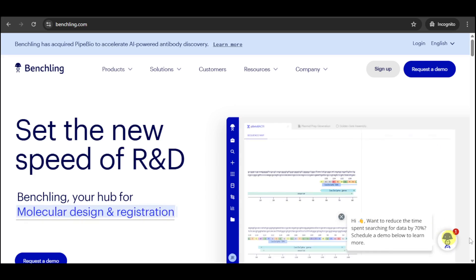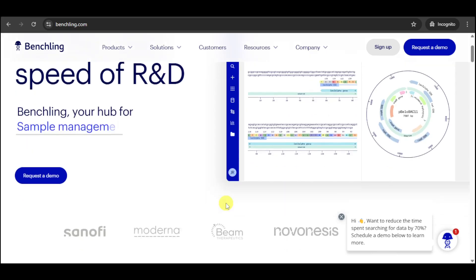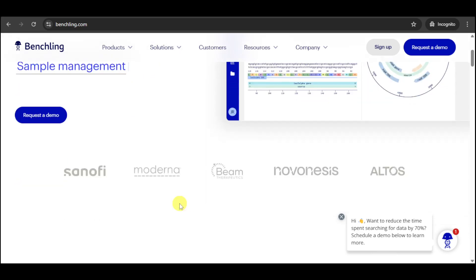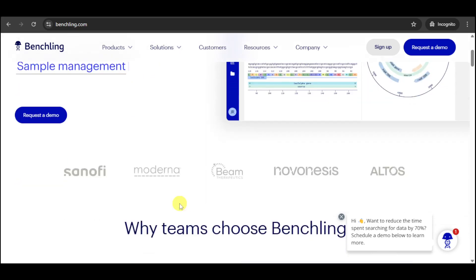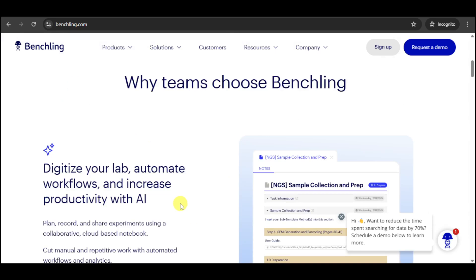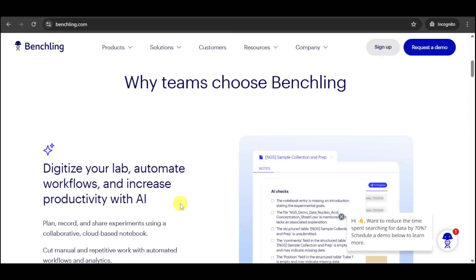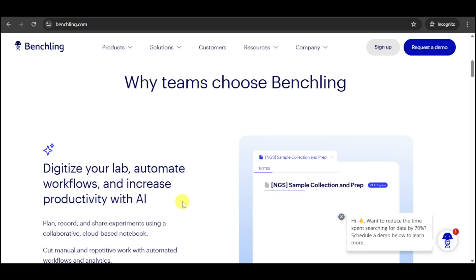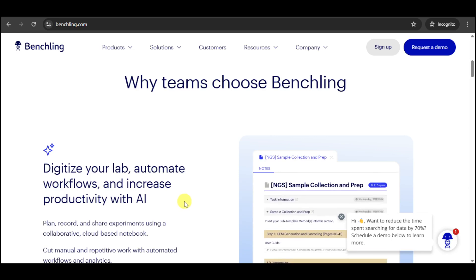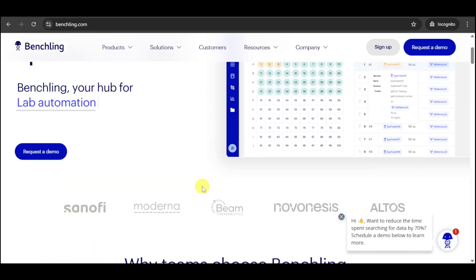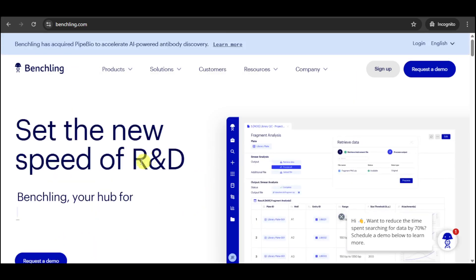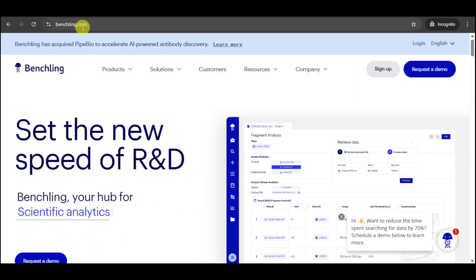In this video, we'll give you a quick overview of how Benchling can help you make breakthrough discoveries faster. We'll discuss some of its key features, and we'll show you how easy it is to sign up for a free Benchling account and start exploring the platform today. First things first, head over to their website, which is benchling.com.